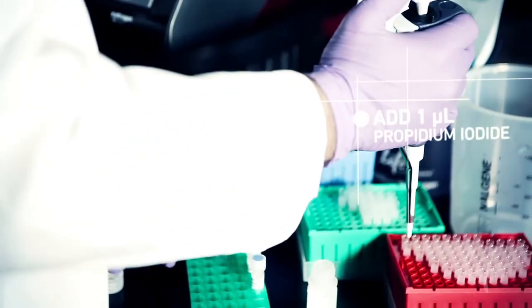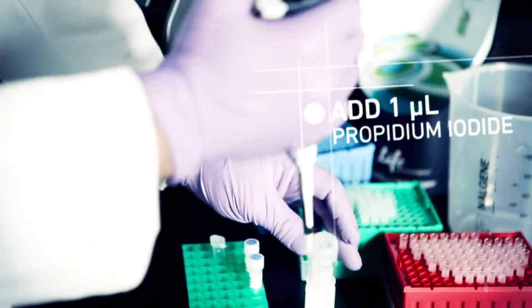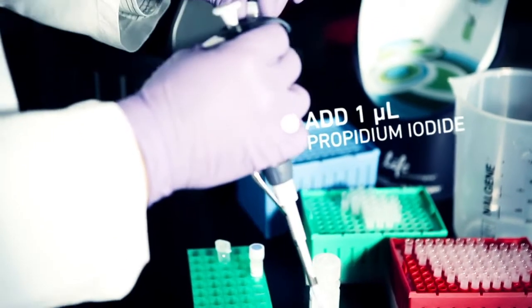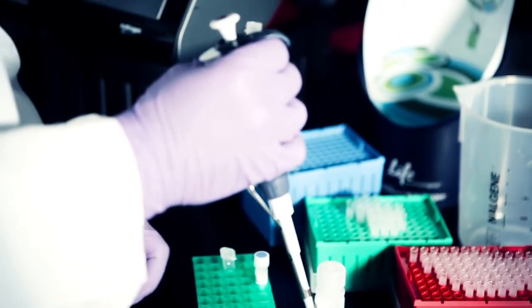Add 1 microliter of Propidium Iodide. This will allow Tally to distinguish dead cells from the apoptotic cells.